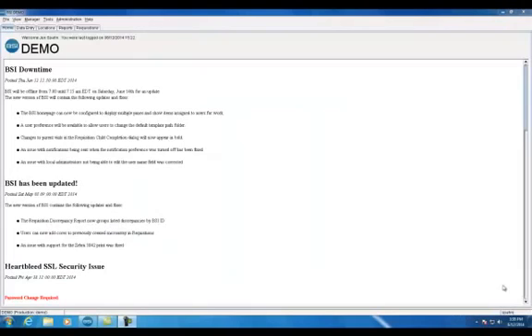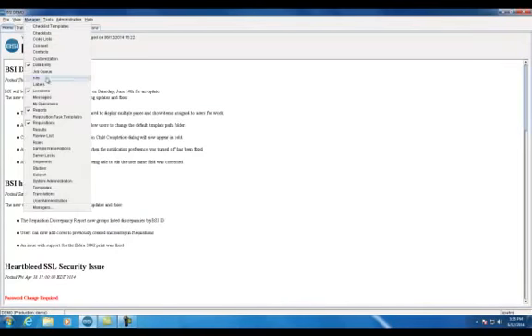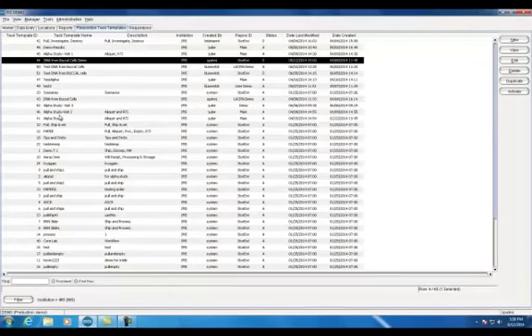First, let's go to the Requisition Task Template Manager. The manager is similar to other BSI managers. There is a table with a list of template records and properties, a filter button, and some action buttons on the right. Other than creating new templates and editing, viewing, or deleting existing templates, you can create a duplicate template or make a template active from the manager.